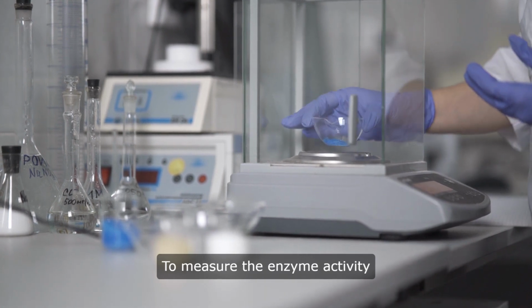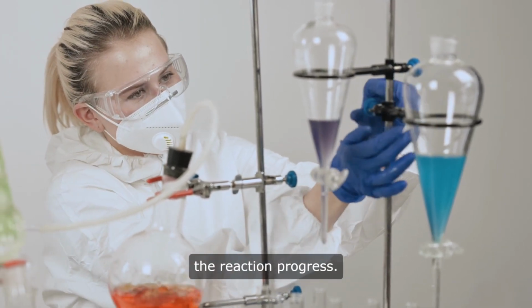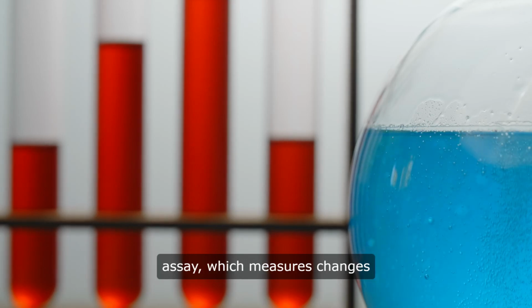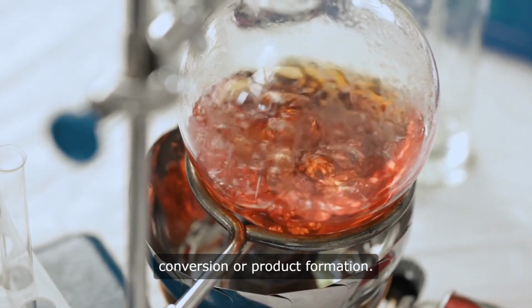To measure the enzyme activity at different pH levels, use a suitable method to track the reaction progress. One common approach is the spectrophotometric assay, which measures changes in absorbance related to substrate conversion or product formation.